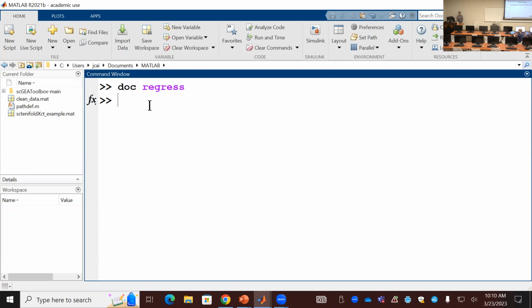But here I just tell you how to do it; I haven't explained what's inside this regression function, how the computer algorithm is working in there. That's involved in the multiplication or optimization. Okay, so you search for the parameter combinations in order to get the best solution.